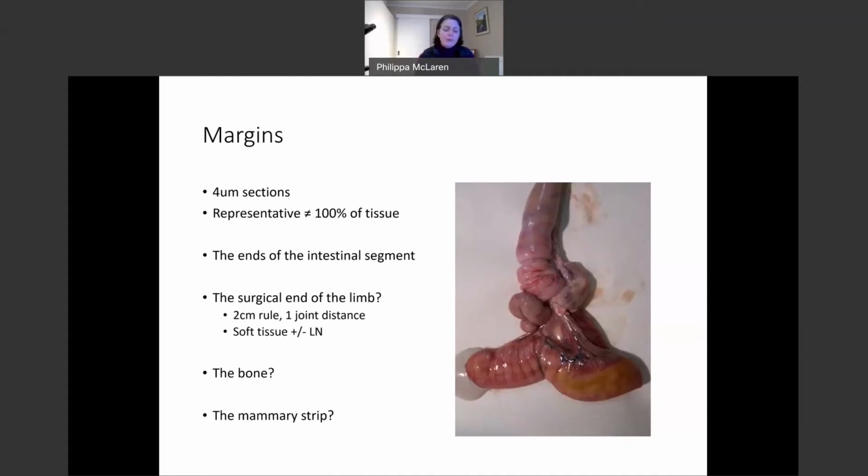That's a good idea. The other thing that you can do for us that really helps with the speed of the diagnosis, bearing in mind that in the lab we don't have a full post-mortem suite, no more full post-mortems occurring in commercial diagnostic labs in Australia. And so you're the one sitting there with your surgical tools. You've just done the amputation. Perhaps before you clean the kit, you might just take off some of the muscle, which really isn't relevant in most cases, and just send us the bone itself and the immediately relevant pieces.